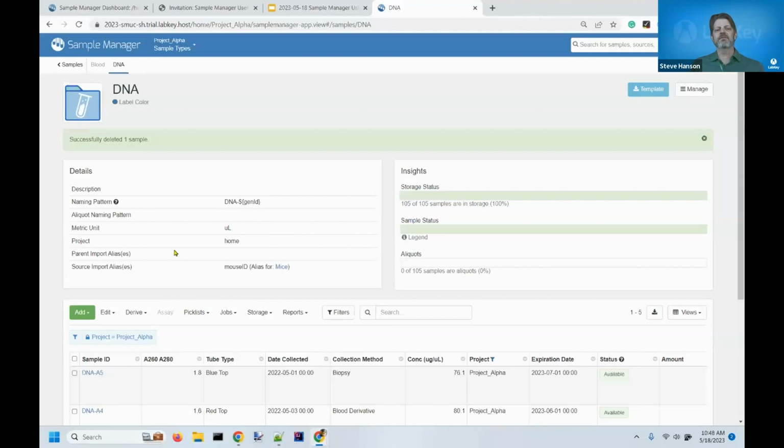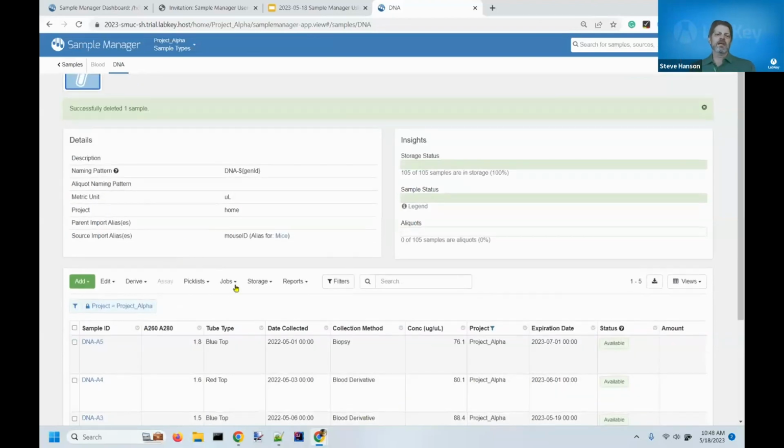If you don't have either of those pieces of data, you've really hobbled yourself in understanding what this sample means. Like, where did it come from? When did it come from? When was it created? So those are classic fields to make required, and that's what I've done right here. This field, date collected, is now a required field, which basically means you can't import data without providing this date. It doesn't look like much until we actually go and look at importing data, so let's try it out.